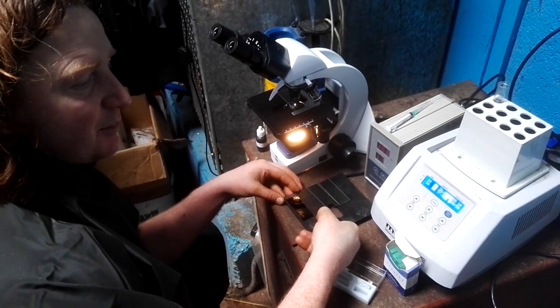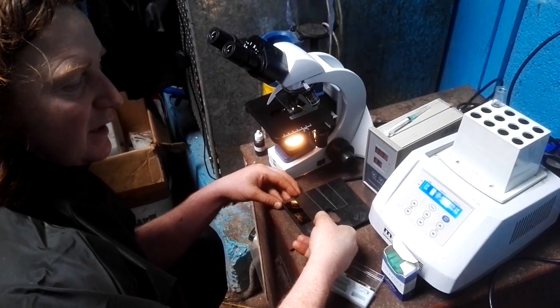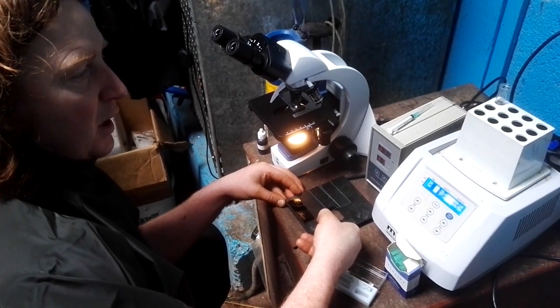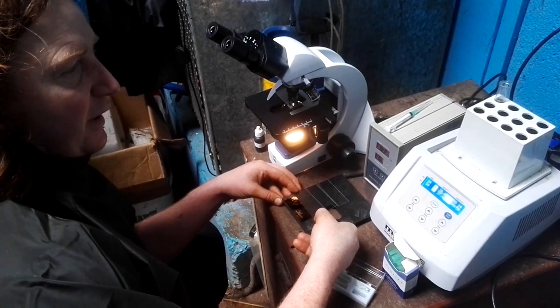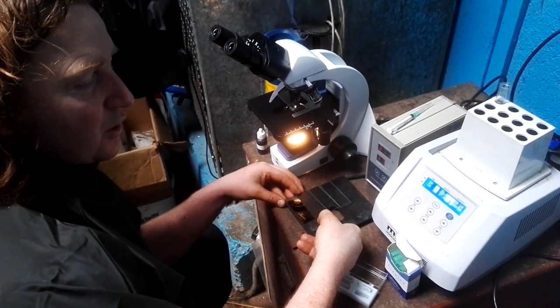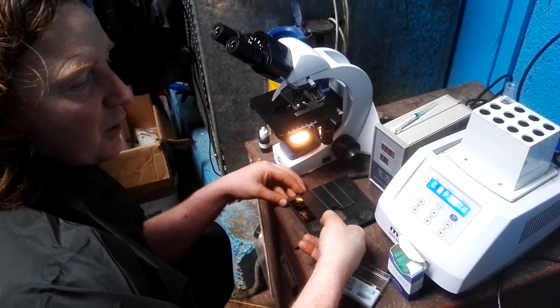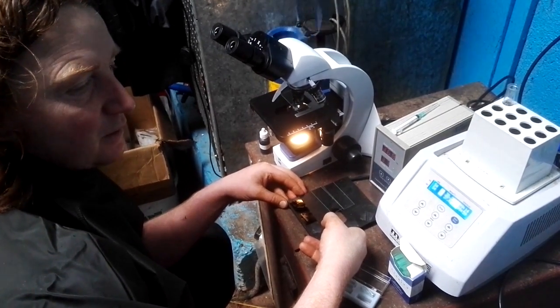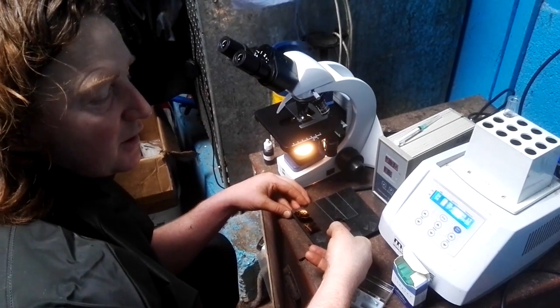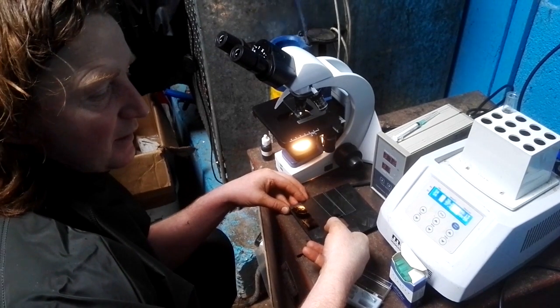That's to check if there's any sperm defects — like thin tails, proximal droplets, distal droplets. Check the shape and size of the sperm; there are all different defects that we're going through. I count to 100 sperm, and out of that 100, there'll be 80% normal and 20% defects. That's the general rule, but it's important to check that. It's an insurance policy for the farmer selling the bull, and for the vet that has seen and tested the bull.